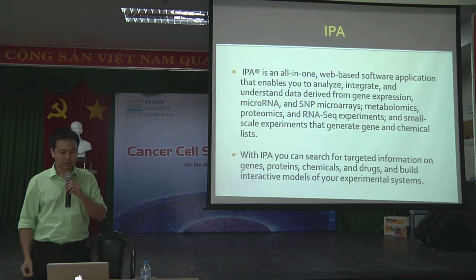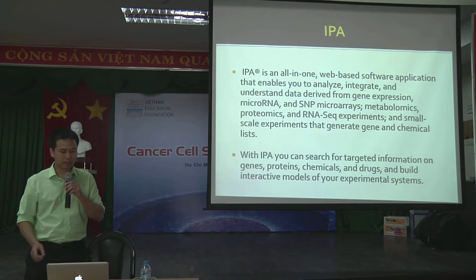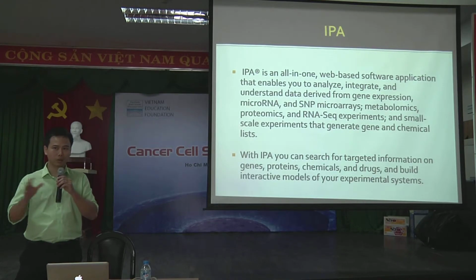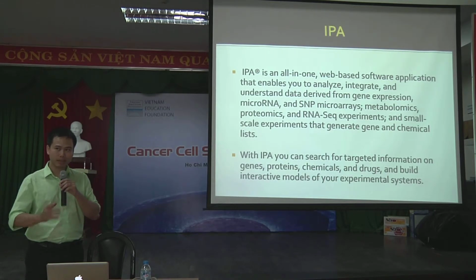understand the data derived from gene expression, the microRNA, and SNP microarray, metabolomics, proteomics, and RNA sequencing experiments. Those data will come from your own data or the data you collected throughout the databases. And you just need to upload to IPA and use IPA to analyze.